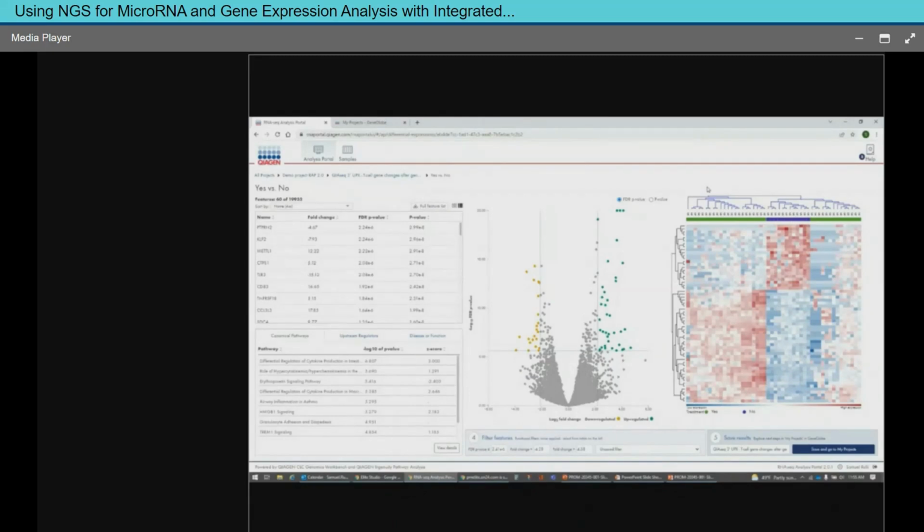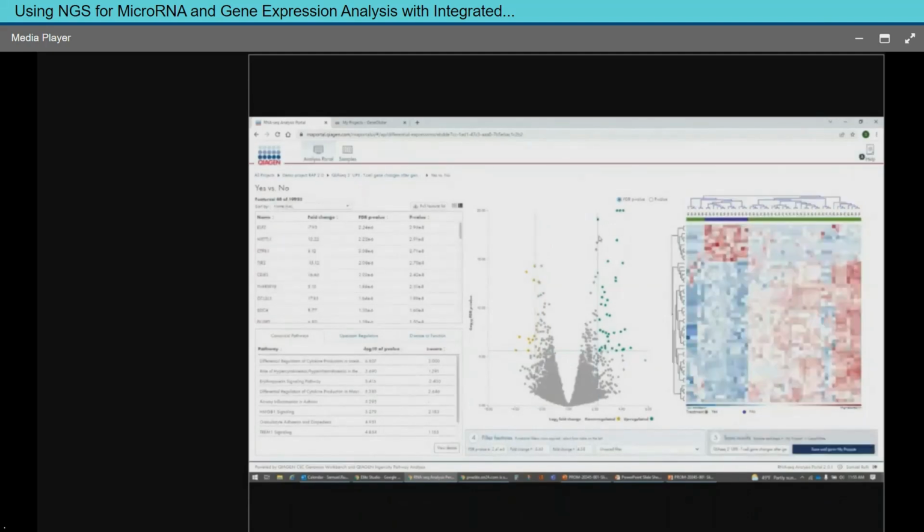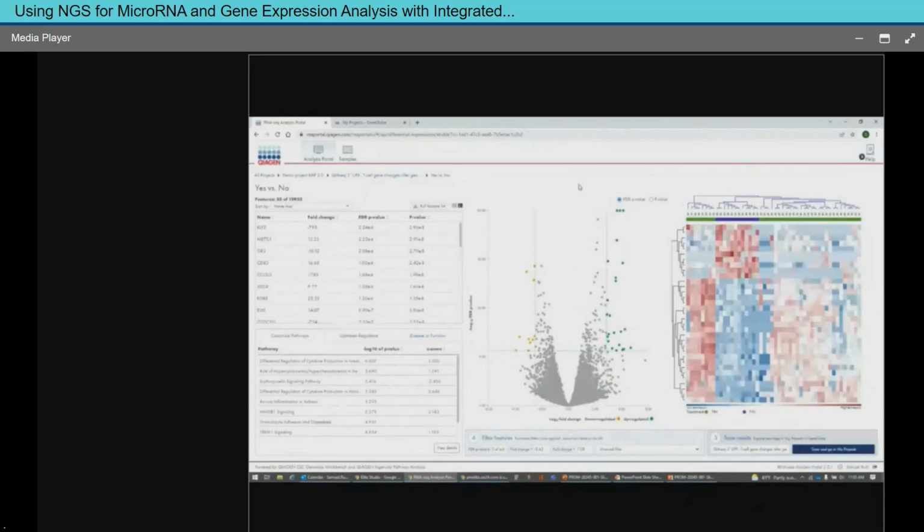I didn't add more metadata to this, but I can tell you that there is more than one class of the green samples here. And you can see the clustering up here into small, distinct clusters. That actually correlates with the CRISPR treatments that we did. So this is the beginning part of where we could whittle this down a little bit more to identify whether or not the cells were treated. And then we can go back and do a different comparison between the different subgroups to identify individual genes that we can use for the different treatments that we did. From here, we would go and identify qPCR panels to come back and look at these.